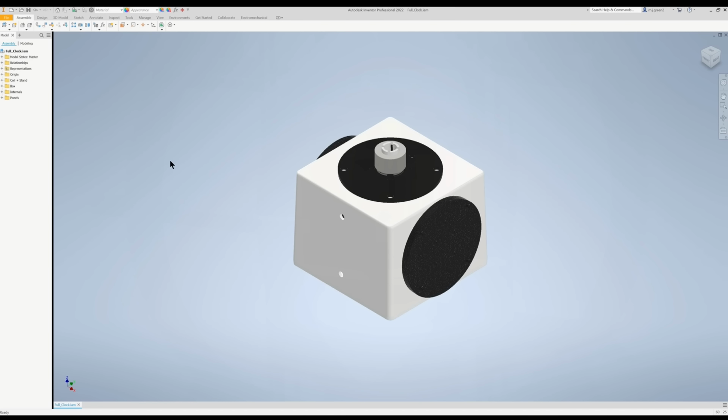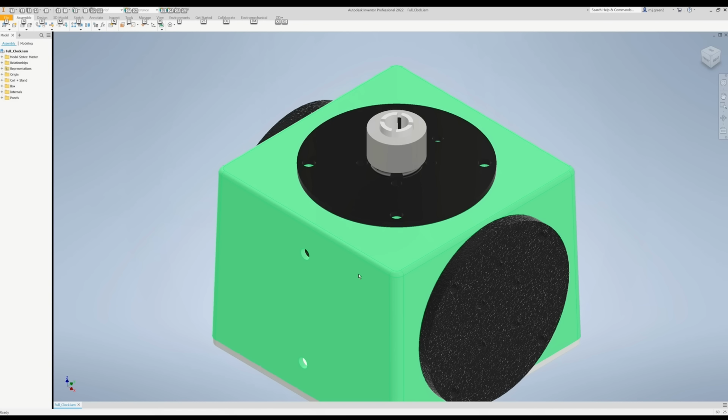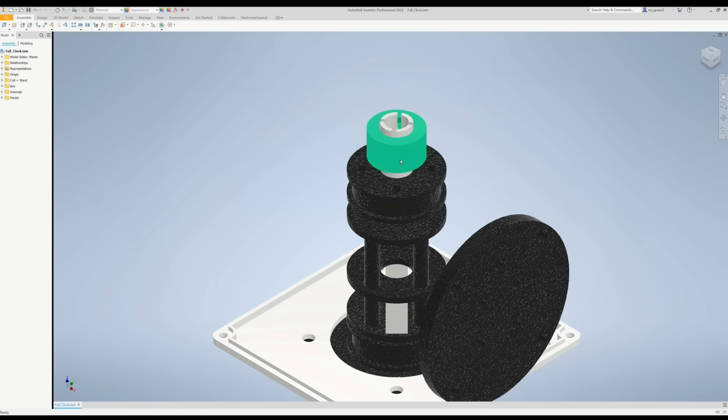So you can now see that we've stripped back the setup to just look at the box and some of the finer components within it. You can see here that we can take off components and look directly at how we built some of the plastic parts, the 3D printed ones. So here's a small part to hold all of the samples, and then using a lid you can compress it and make sure it doesn't slip down. And testing all these parts is made easier, and it saves time in both printing and experiments later.